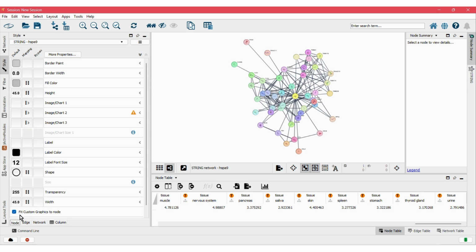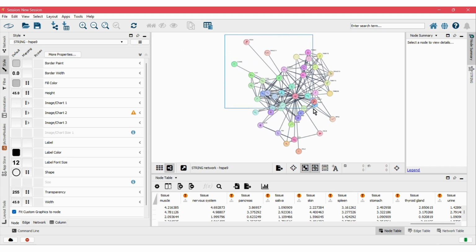For example, to map node color manually, select the nodes you want to customize. You can click them one by one, like this. Then click on Shift. Or, you can also press Control plus left click on your mouse and drag across the nodes.